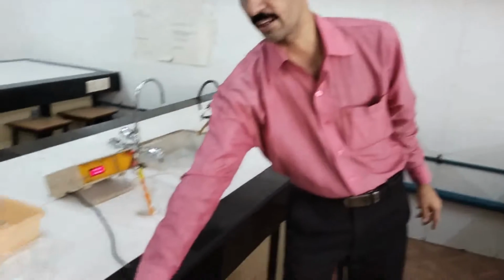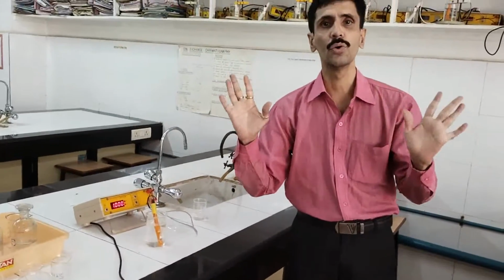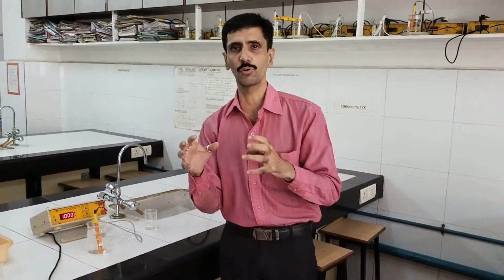As you all know, this is an instrumentation experiment where the instrument used is a conductometer. Always remember, my dear friends, whenever you start with the experiment, the first job is to put on the instrument. Okay, and your instrument is on. That's the first thing you need to do. And then you have to start with your preparation of the solutions, etc., so that it has at least 10 to 15 minutes to give you accurate, stabilized readings.